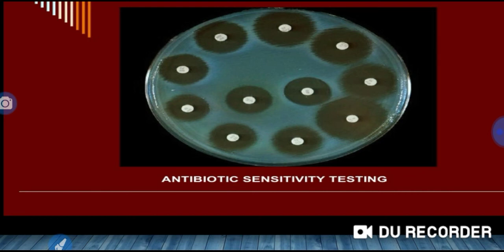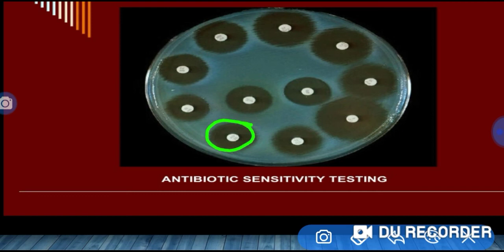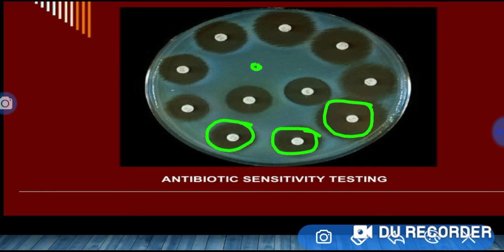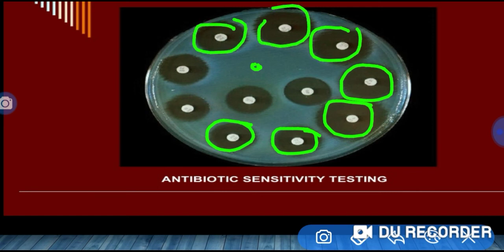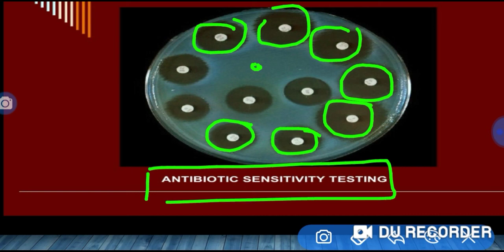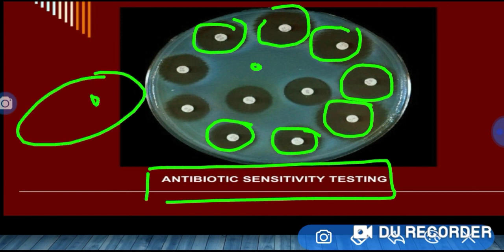We place antibiotics on the plate. Around different antibiotics on the plate, different zones appear. Sometimes there is no zone created, which means the bacteria is very resistant. When a clear zone is made and it is bigger, that shows the antibiotic is very effective at killing the bacteria. So this lawn culture is helpful for antibiotic sensitivity testing and to see which bacteria a virus — called a bacteriophage — infects, where we find clear circles or plaques.